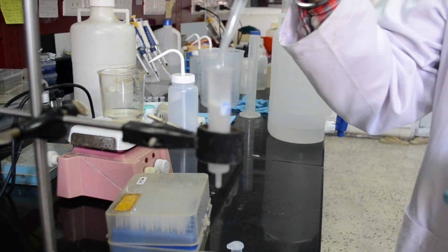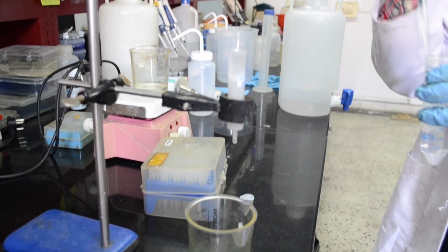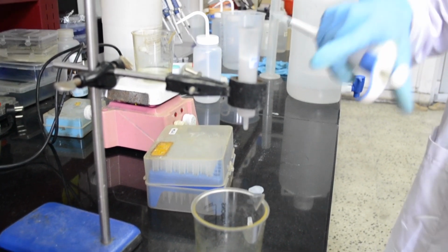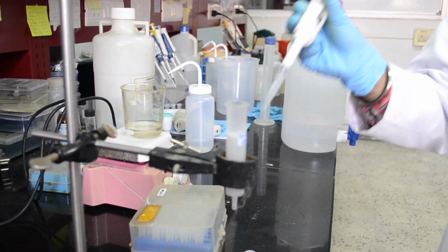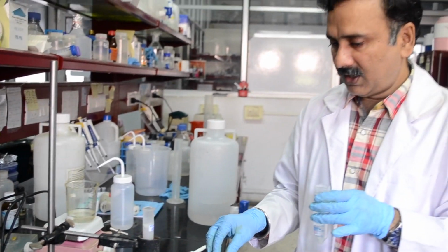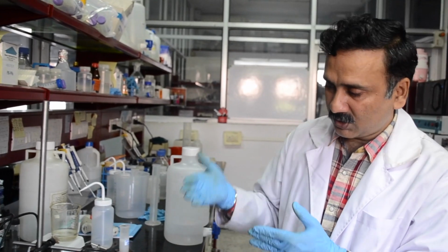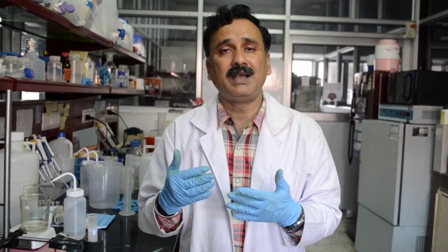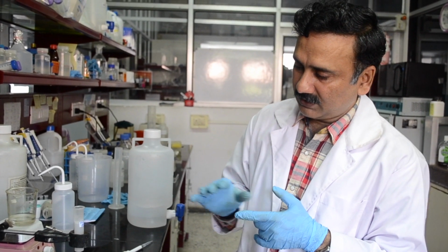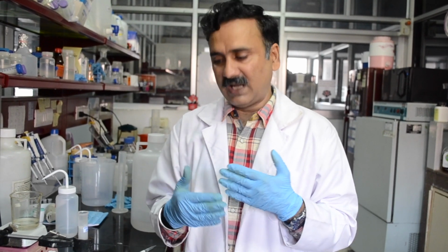So while you are adding, you have to ensure that there is a smooth flow of buffer from the lower end of the column, and also that there is no particulate matter on top of this top filter, because that top filter is being kept simply to avoid exposure of the column material to particulate matter or aggregated proteins. So that's why it protects the column from any kind of damage.